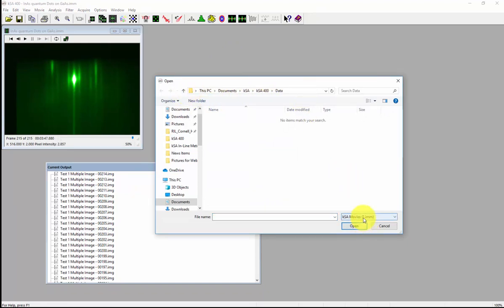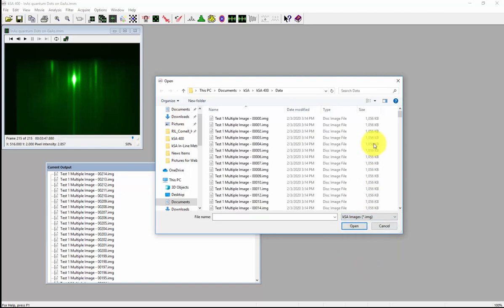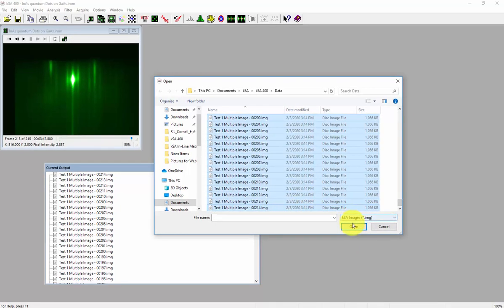Choose file type .img, select the files that you want to export, and click open.